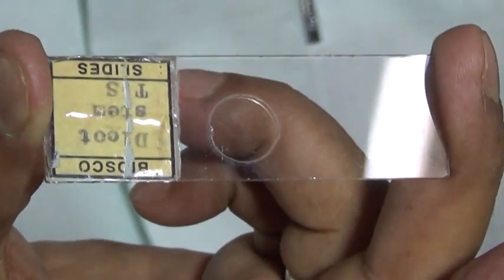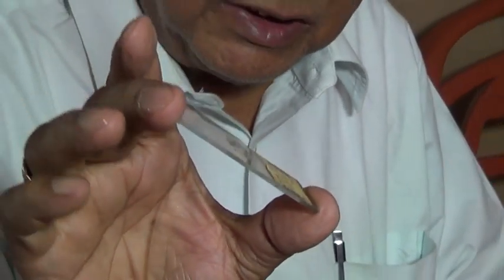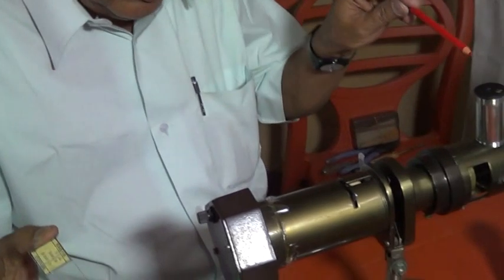This is Microscopic Slide. A Microscopic specimen fixed on it. This Microscope slide can be projected by this Projector part.